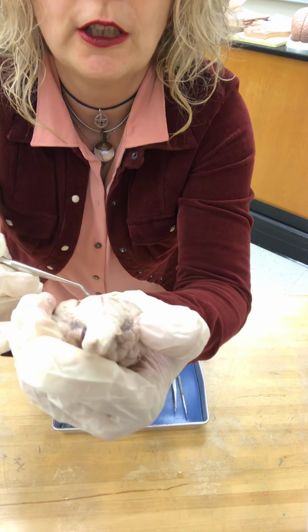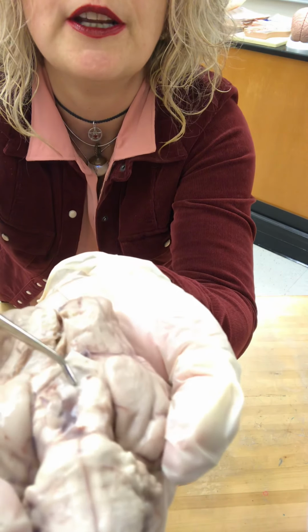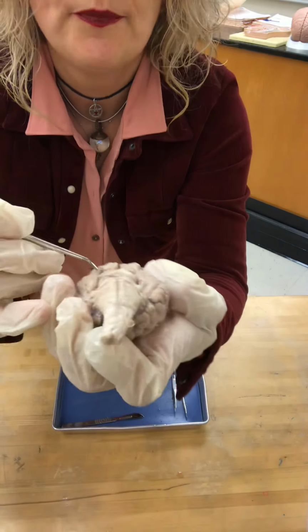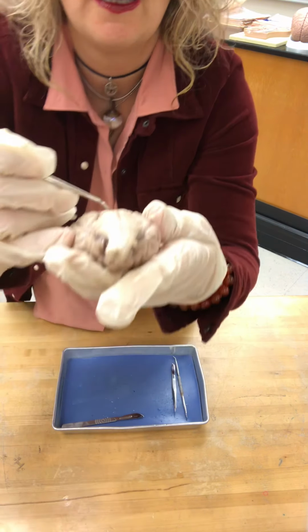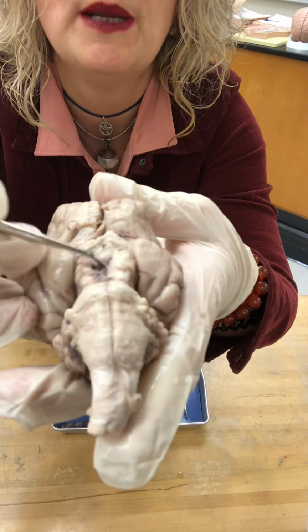All right, then you're going to look for the mammillary bodies, and it should be right here. You can see the mammillary bodies right there, two little enlargements, okay? Oculomotor nerve should be right behind that, and I can't see the pituitary gland. I cannot see it. But what I can see is the midbrain.